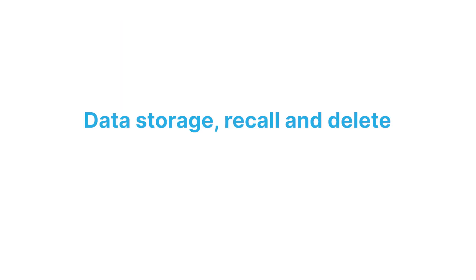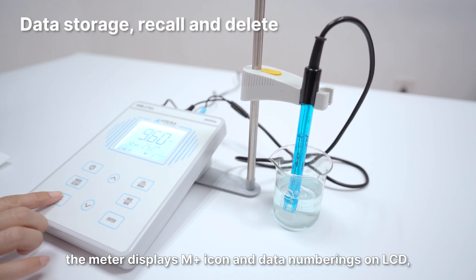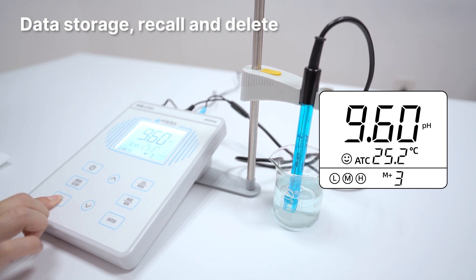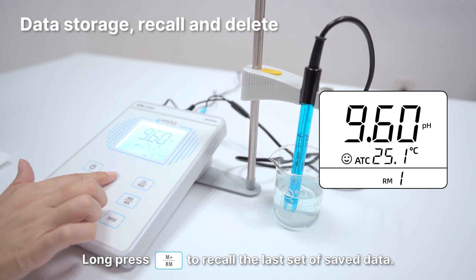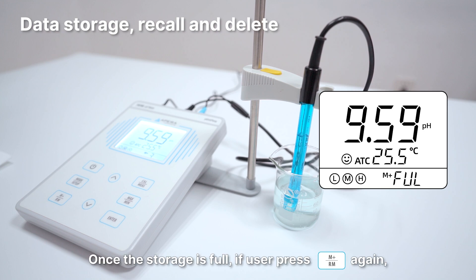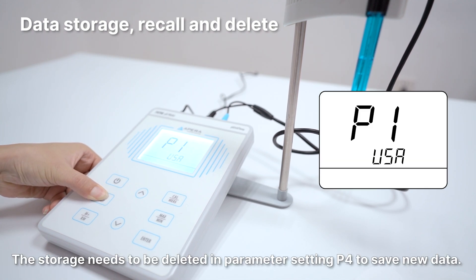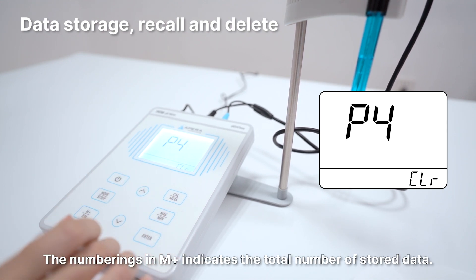Data storage, recall, and delete. When readings are stable, short press the M+ button. The meter displays the M+ icon and data numberings on LCD and saves the measurement data. Long press the RM button to recall the last set of saved data. Keep pressing up or down to recall the data successively. The meter can store 50 sets of data. Once the storage is full, if the user presses the M+ button again, the full icon will be displayed on LCD. The storage needs to be deleted in parameter setting P4 to save new data. The numberings in M+ indicate the total number of stored data.